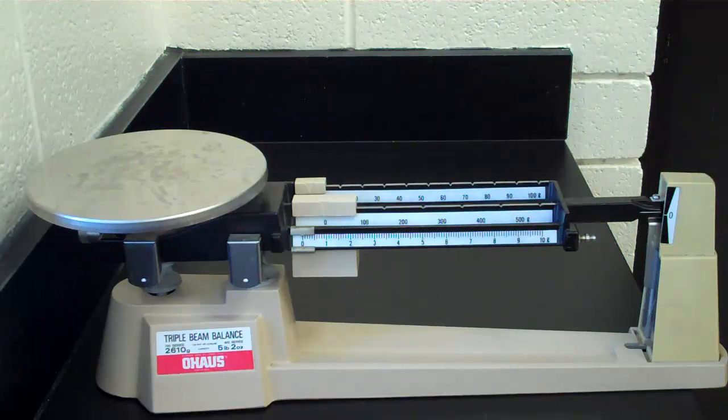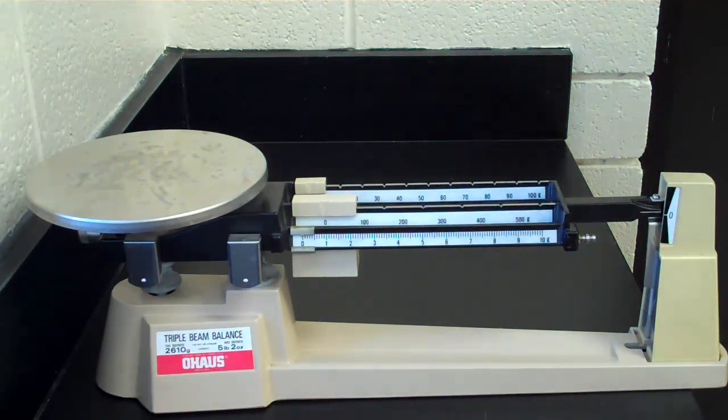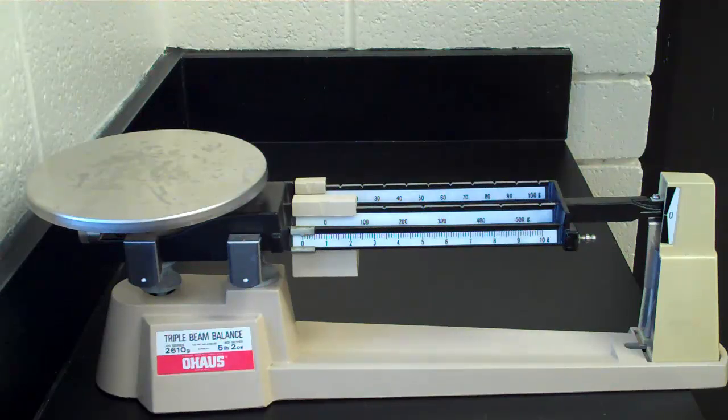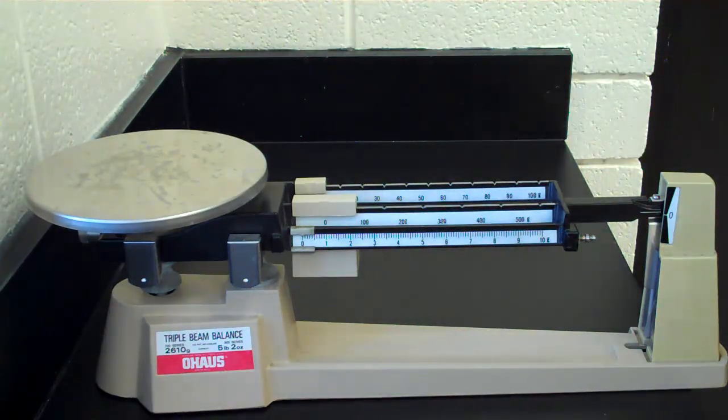We want those to be matched up. If they're not matched up, we need to have them line up, and that tells us that the balance is zeroed out. So it will give us an accurate reading.